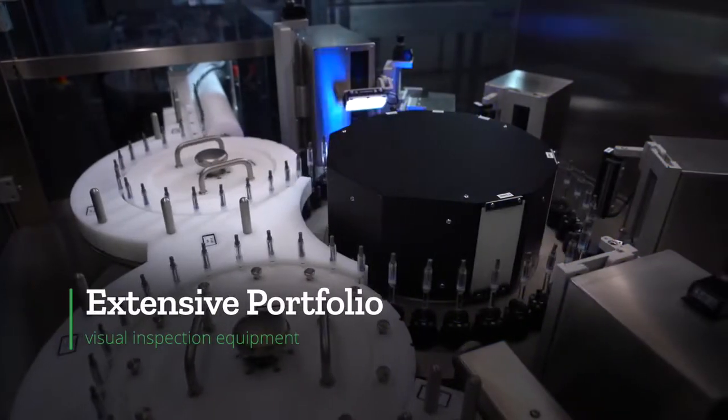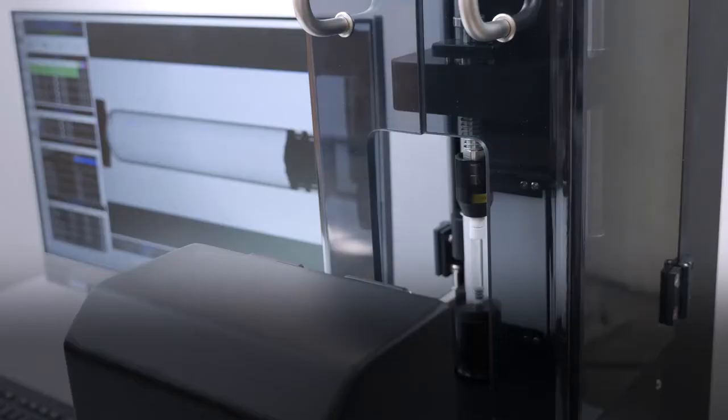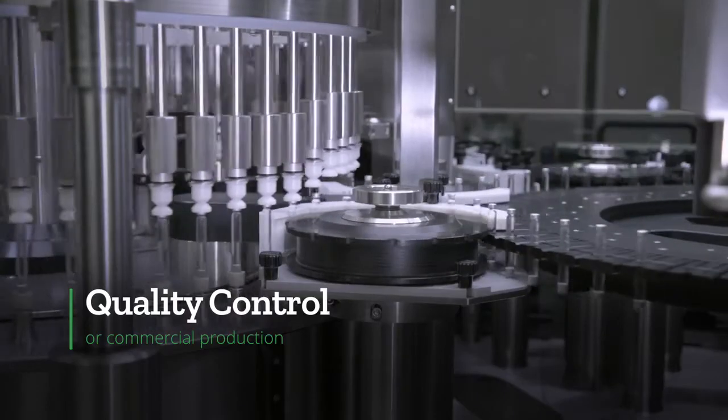With an extensive portfolio of visual inspection equipment, Stevanotto Group can support your quality control requirements during lab development or commercial production.